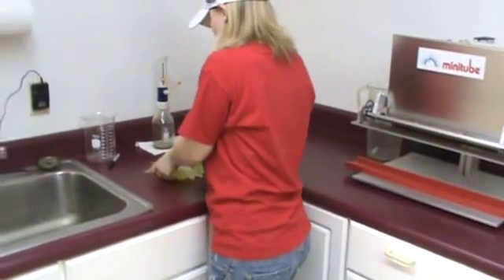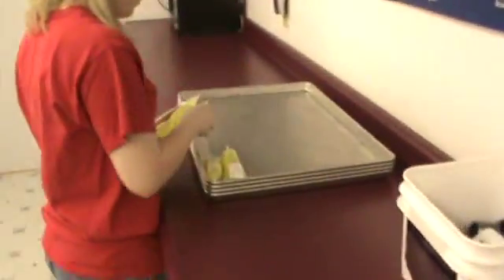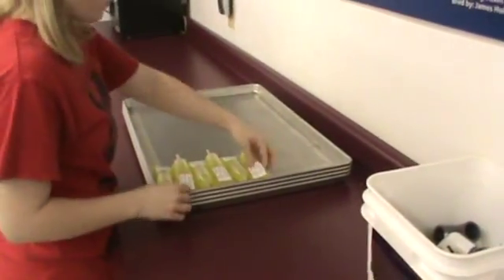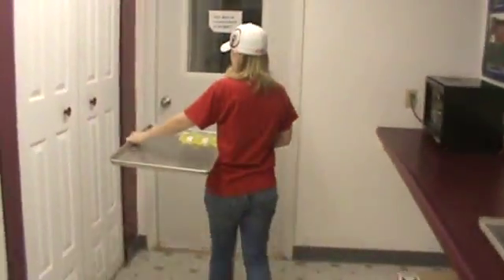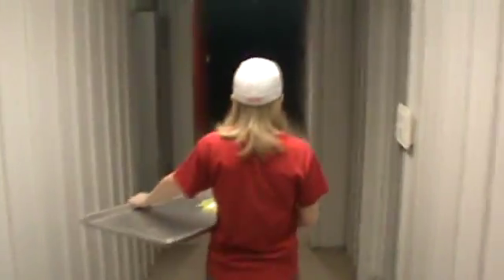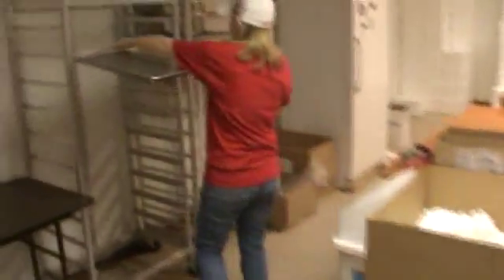That is a special room where we cool down the semen prior to shipment, which we keep typically between 60 and 64 degrees. So here she is — these are the type of racks that we utilize here at Prairie State, and she is putting the semen on there. Typically we wait for four boars, but just for demonstration purposes, we will follow Marissa back to the cool room. Sounds like we're having quite a thunderstorm outside right now. Marissa is going into the cool room and putting it on the racks.